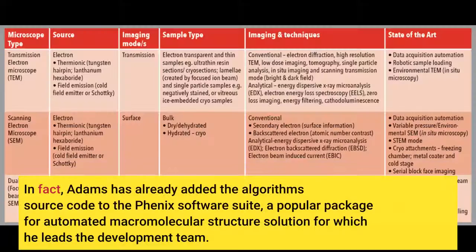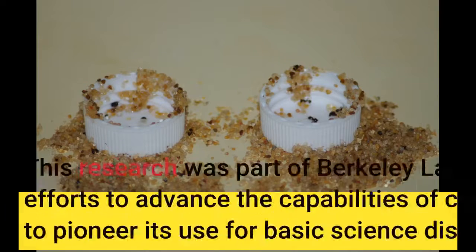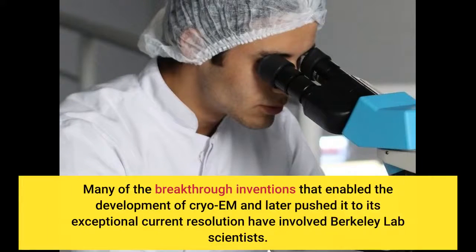In fact, Adams has already added the algorithm's source code to the Phenix software suite, a popular package for automated macromolecular structure solution for which he leads the development team. This research was part of Berkeley Lab's continued efforts to advance the capabilities of cryo-EM technology and to pioneer its use for basic science discoveries. Many of the breakthrough inventions that enabled the development of cryo-EM and later pushed it to its exceptional current resolution have involved Berkeley Lab scientists.